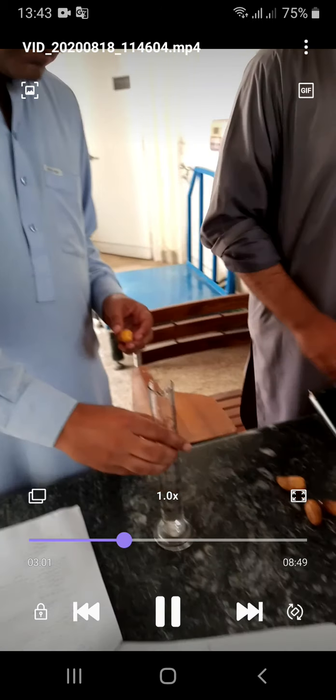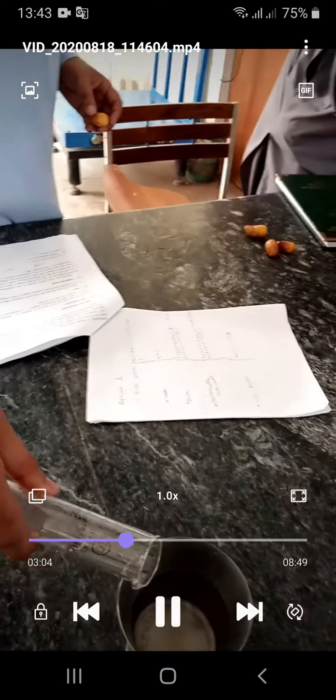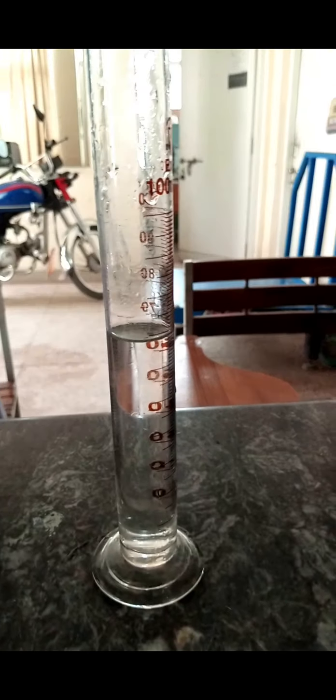Let's see again. Before, we will fill the cylinder up to a certain level — for example, it is now on 25 ml. We will put the fruit in like this and again measure. It is now on 36 or 37 ml. So the difference will be recorded as the volume replaced by the fruit.